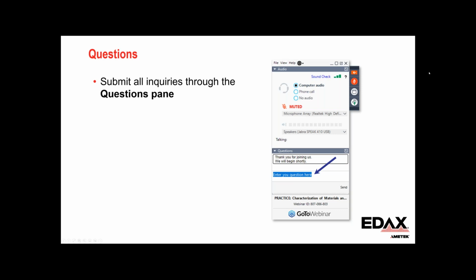So the first question that came in is, when will OIM version 9 be available? We're basically transitioning into testing, so we're hoping to have it available the first of the year in that time frame. There was another question regarding the high-speed camera: what's the beam current required for those 6,000-plus patterns per second?